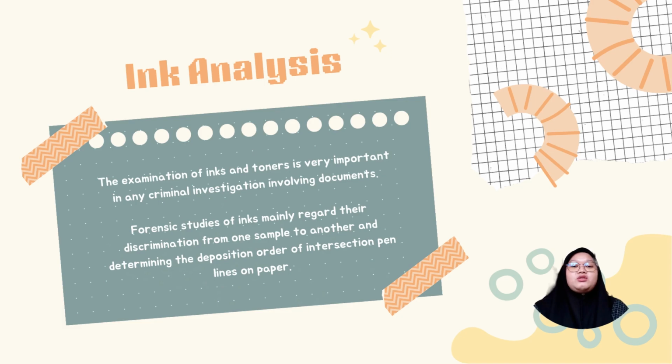The examination of inks and toners is very important in any criminal investigation, especially involving documents. The most common forensic issues often deal with the alteration of an original document. For example, a modified check amount, an added line on a contract, or a false signature on a will.